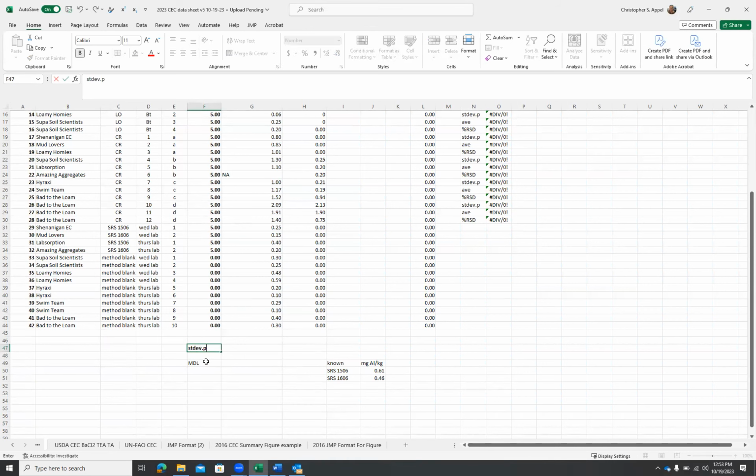Okay. So then your method detection limit for exchangeable acidity is 0.72, and for aluminum is 0. Right. So if you go to your quality control table, this is all method stuff. Let's see. So 0.00 milliliters here. And actually, hydrogen is not correct. It should be EA for exchangeable acidity, and that is 0.72 milliliters.